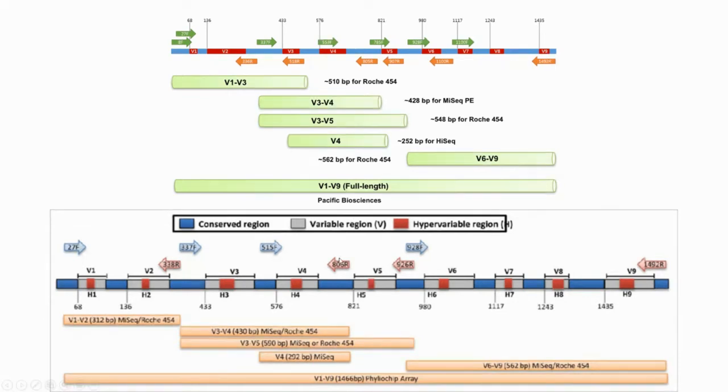Okay, so this is just to show you different platforms you can use. They develop different commercially available primers that you can use to amplify your target sequence and perform the sequencing. Any questions so far?